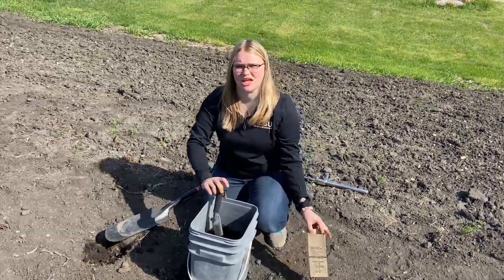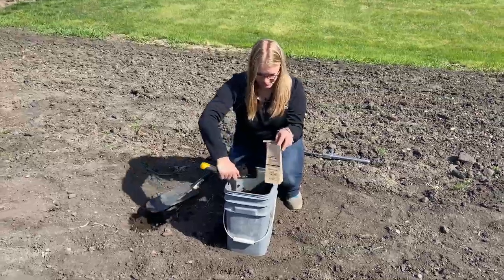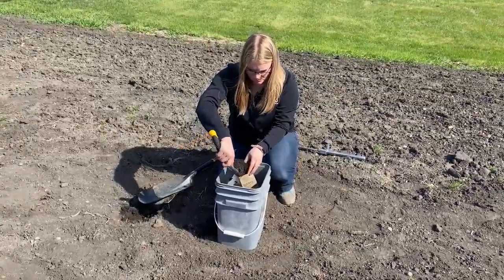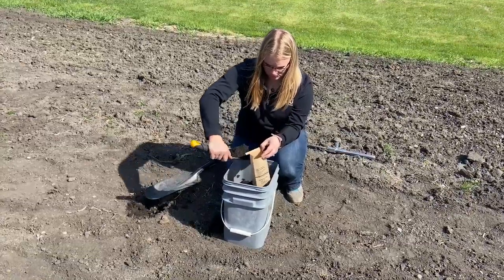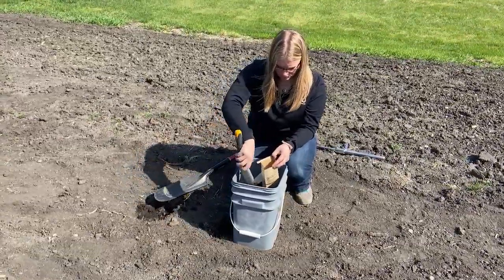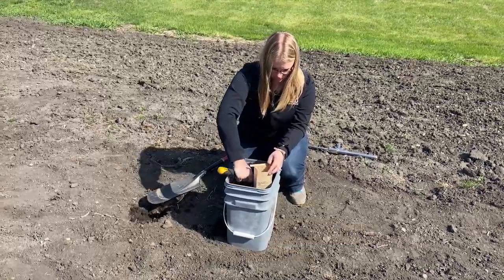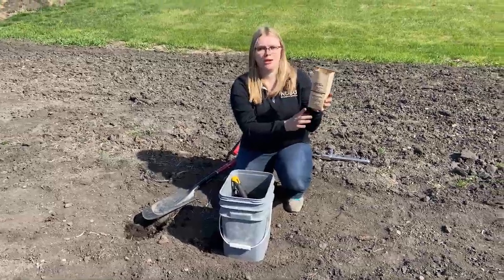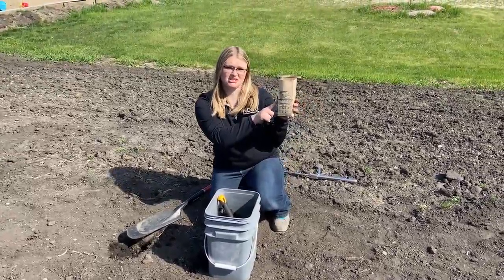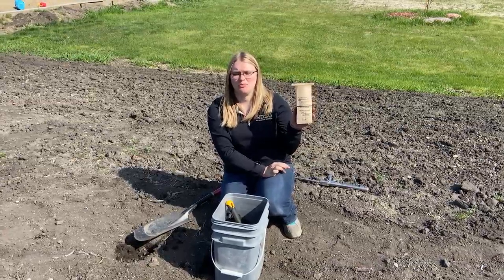Once my soil is mixed together, I'm going to fill my soil sample bag. I'm going to fill my sample to at least the fill line, which will be approximately one pint of soil.